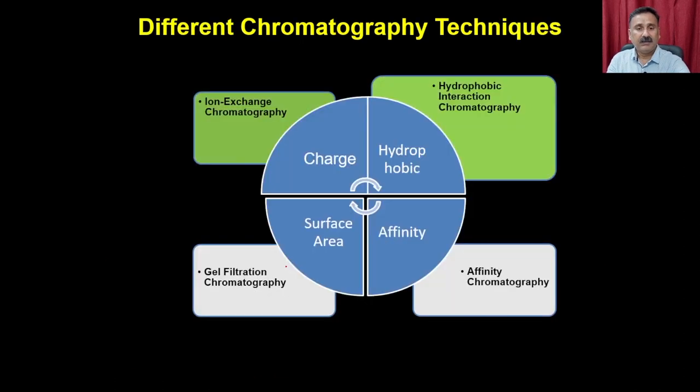So this is all about the chromatography techniques where we have discussed the exploitation of the charge. We have discussed the different steps we have to do for ion exchange chromatography, and then we also discussed hydrophobic interaction chromatography, the different steps and how you are going to perform it. So with this, I would like to conclude my lecture here.